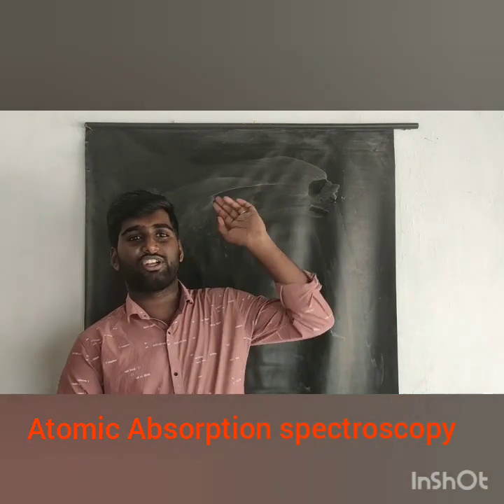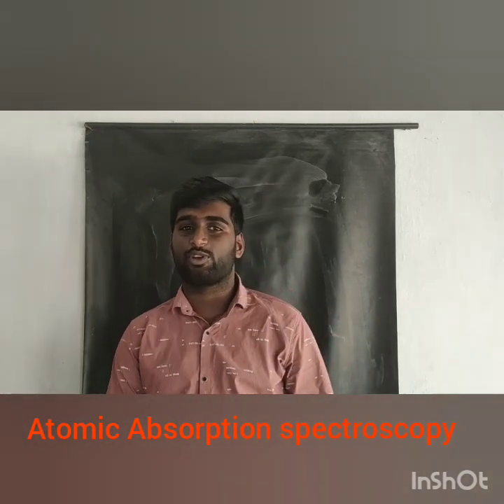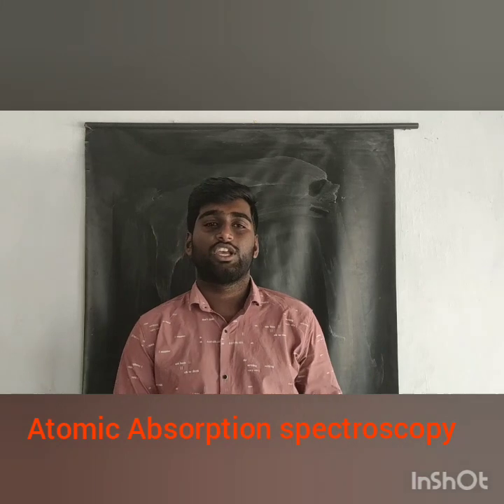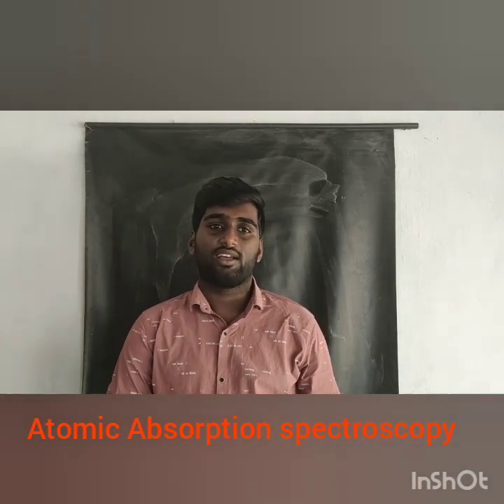Before going to the instrumentation of atomic absorption spectroscopy, I want to once recall the principle. What is the principle of atomic absorption spectroscopy? If light of resonant wavelength is passed through a flame containing atoms, part of the light is absorbed, and the extent of absorption is proportional to the ground state atoms present in the flame. That is the principle.